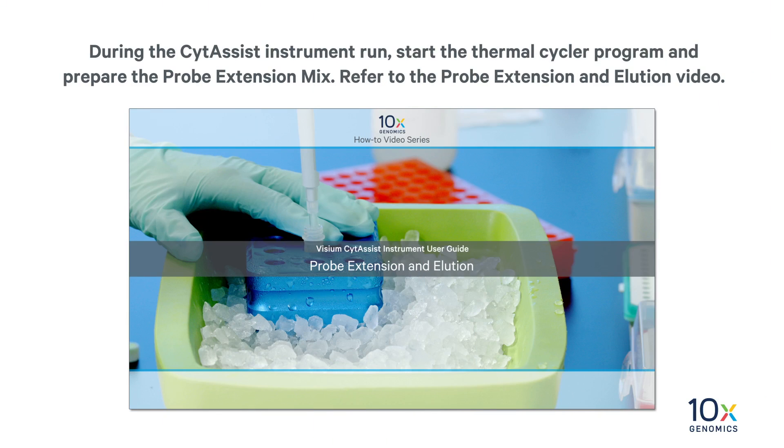During the CytAssist instrument run, start the thermal cycler program and prepare the probe extension mix. Refer to the probe extension and elution video.